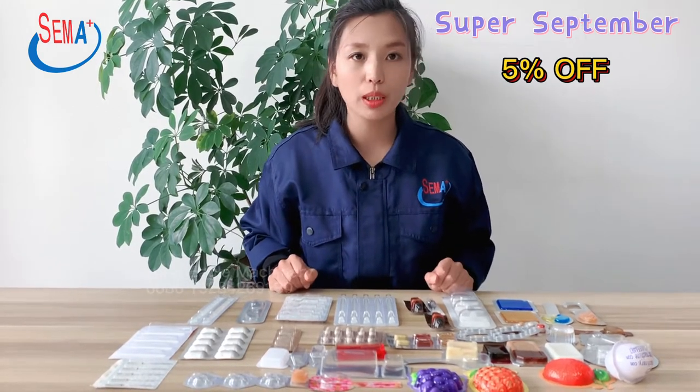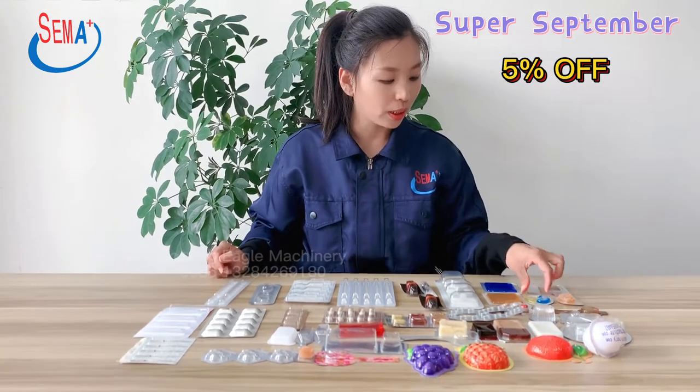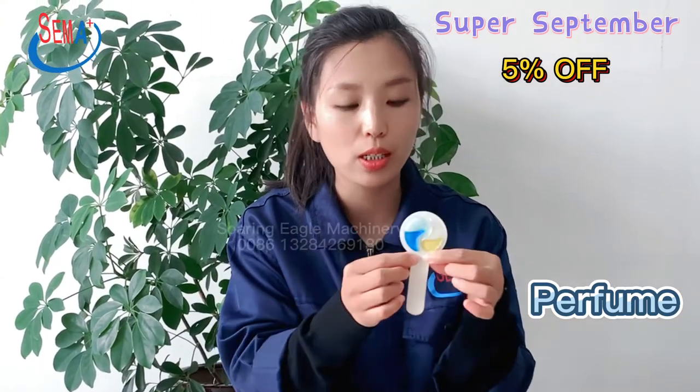We produce the blister packing machine. These are some products that were packed by our machines for reference. The blister machine is used widely — it can be used for pharmaceutical products, food, cold packing, etc.